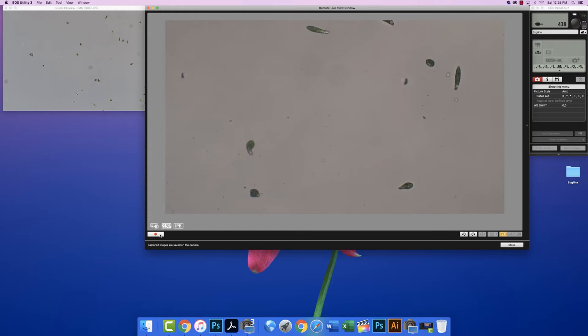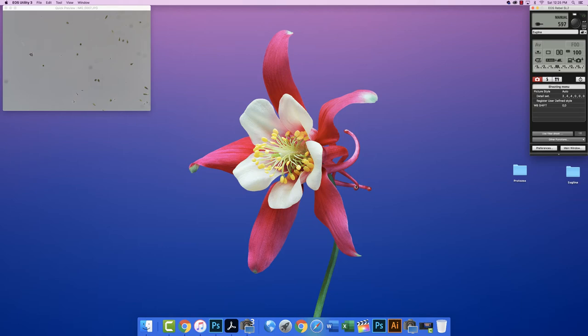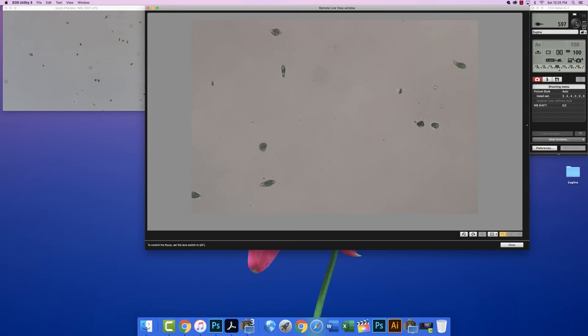Cancel the warning. Go back to open the live view window. We can check our shutter, 1/100 now. I'm gonna increase the light a little bit. Up, it's all the way up. So the maximum speed that we can shoot at this setting is 1/100. So I'd like to shoot faster than that because these critters are moving pretty quickly.